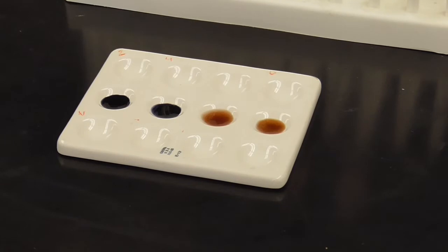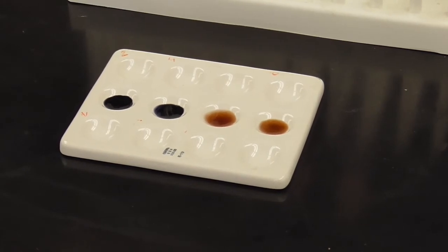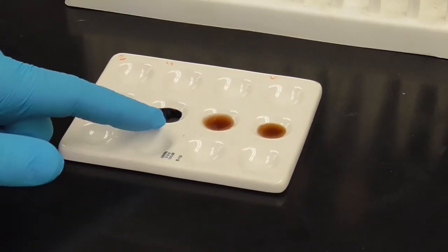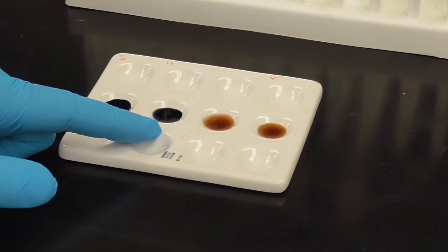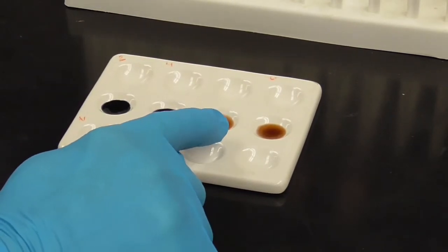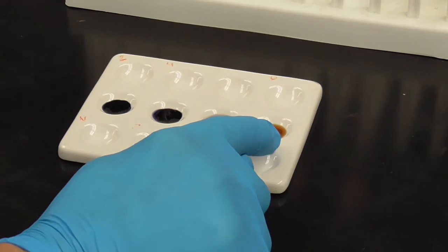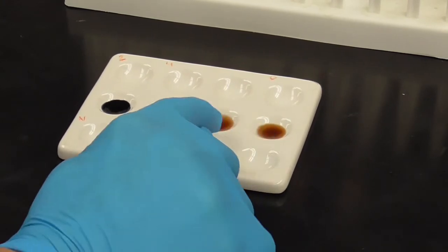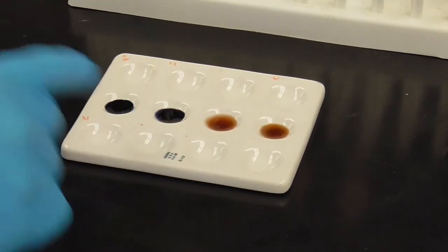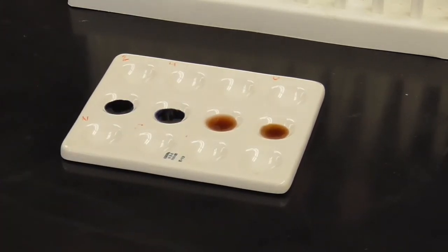Okay. So at different pHs, clearly that enzyme behaves differently. We have plenty of starch at the pH 2 and pH 4, which are our acidic environments. Here's pH 7, which would be very close to what's in the body, and pH 10, which is actually way above what's in the body. But in both of those cases, that enzyme seemed to function just fine, but it did not work very well down at the lower pHs.